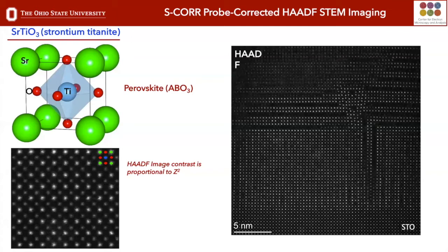But if you're interested in structural defects and seeing how well you grew a CVD layer or a PVD layer or an atomic layer deposition, here's a strontium titanate substrate that's been grown, and the growers thought they had a pretty uniform homogeneous film that was epitaxial. And if you look at this, it looks rather epitaxial.